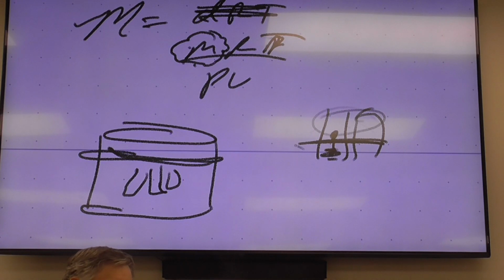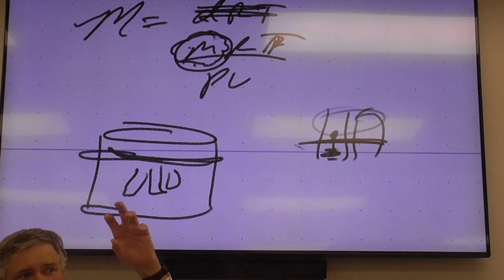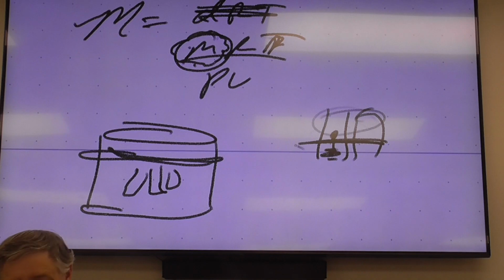So on that page, you're only going to fill in the one line for whichever one you have. Okay? You're not going to do all three, you're only going to do that one. But you're going to have 3 trials of that. So the next thing that you're going to need to know, so that will get you the mass of the gas in the pipette. The R is going to be your gas law constant.